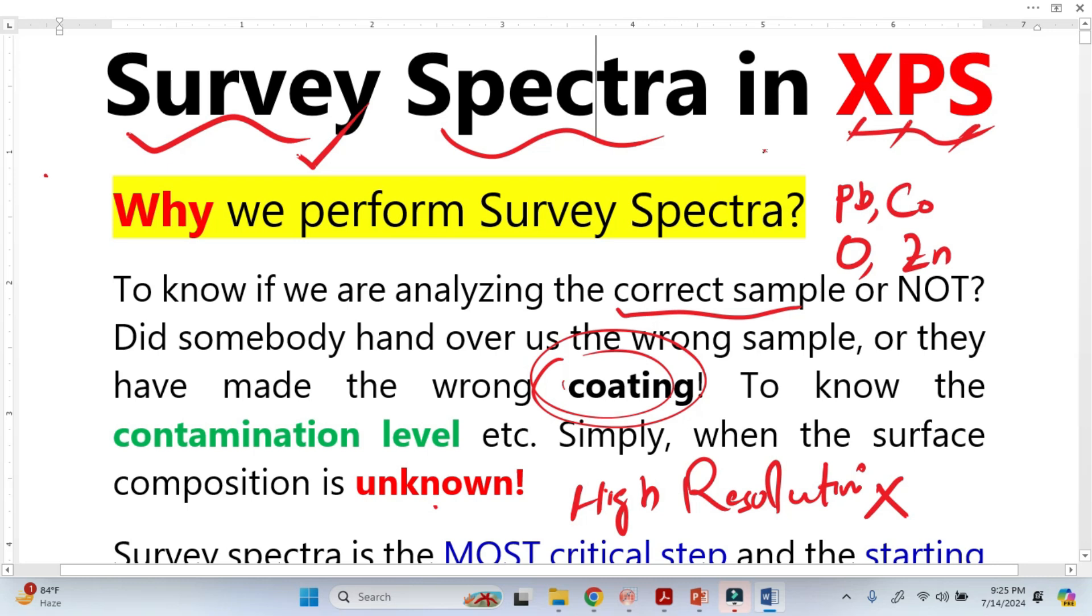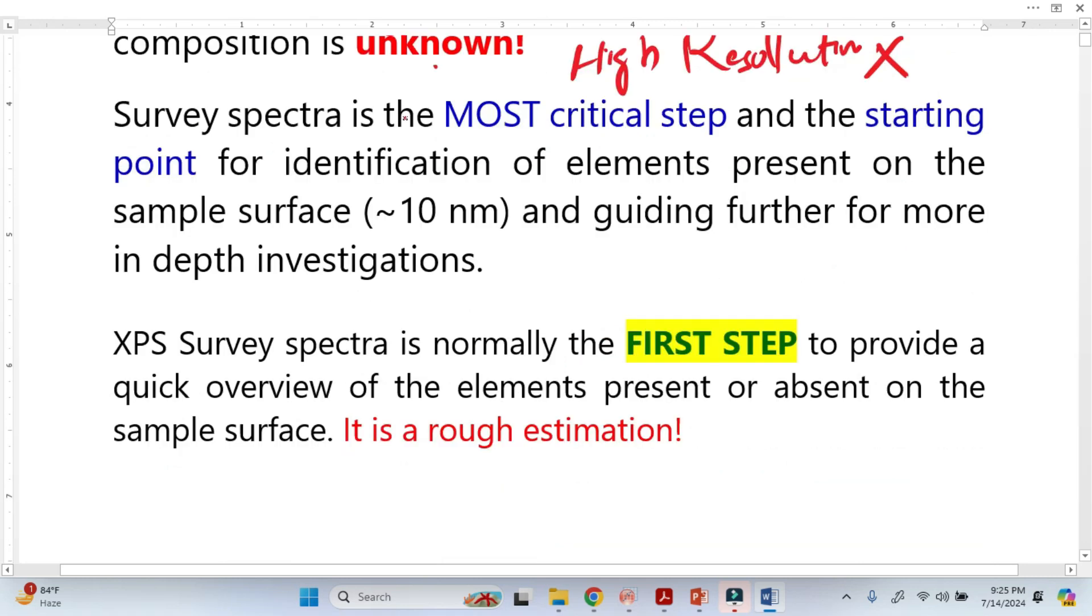Because XPS is a surface technique, it will detect a lot of things and what is the contamination level. So survey spectra is basically the most critical step and starting point for identification of elements.